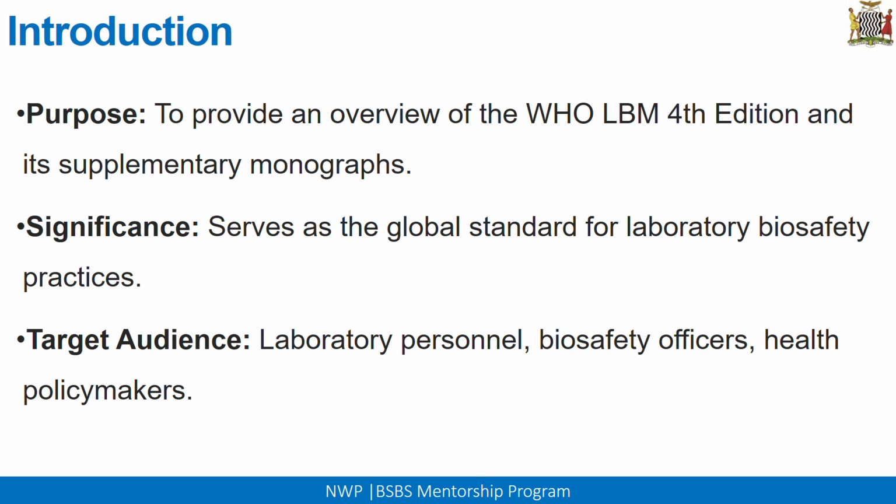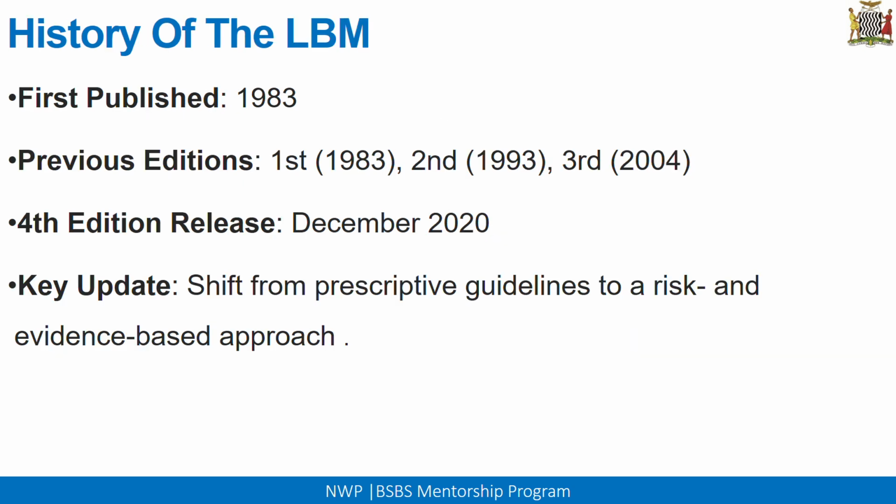Then its significance: this manual serves as the global standard for laboratory biosafety practices. The targeted audience is laboratory personnel, biosafety officers, and health policy makers, to mention but a few. So let's look at a brief history of this document.